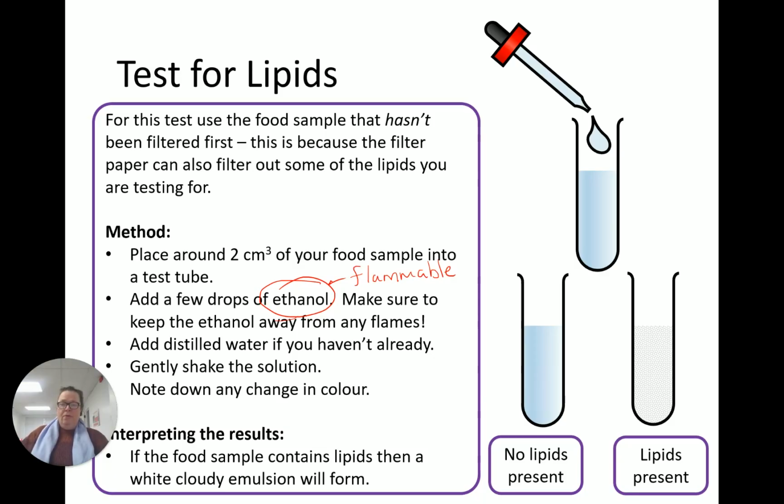So ethanol, shake. Where's my pen? Sorry. Oh, there it is. Shake. We will get a white, cloudy emulsion. All right. So that is our test for lipids. So there's our 4 food tests.